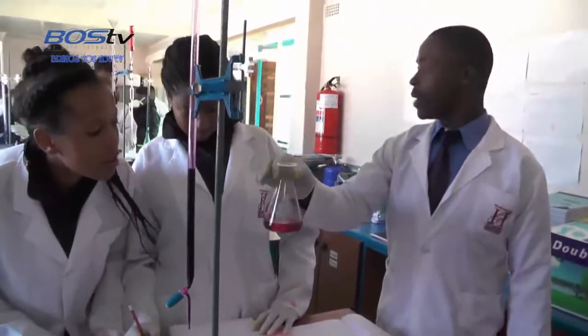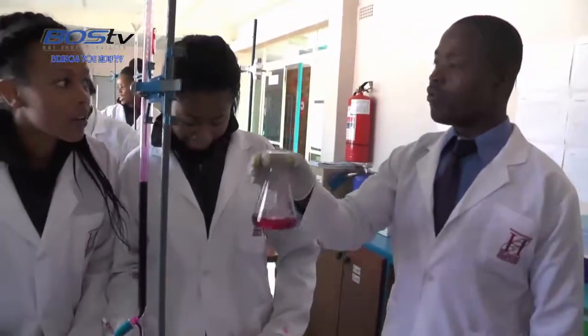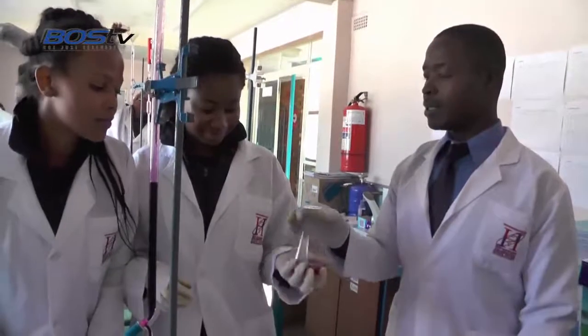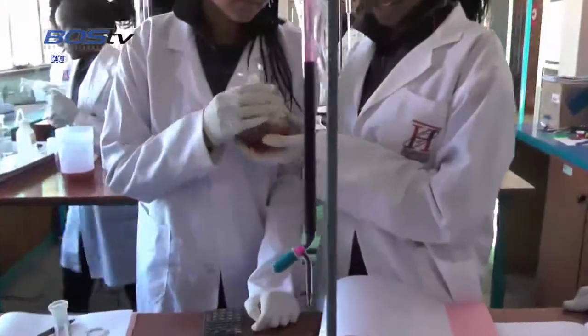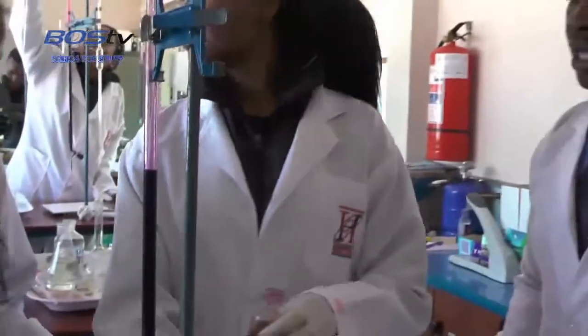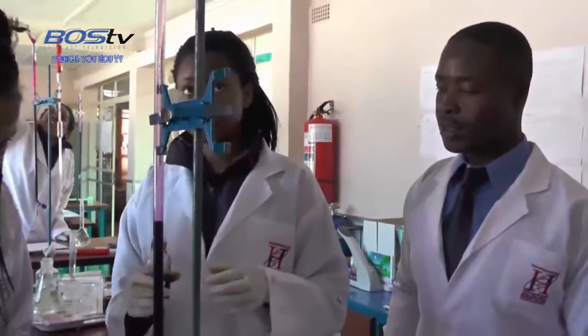You've overshot the end point. It should be faint pink. Just one drop will change the colour if you are accurate. Do it again and do it accurately. As you get to the end point, swirl clockwise.